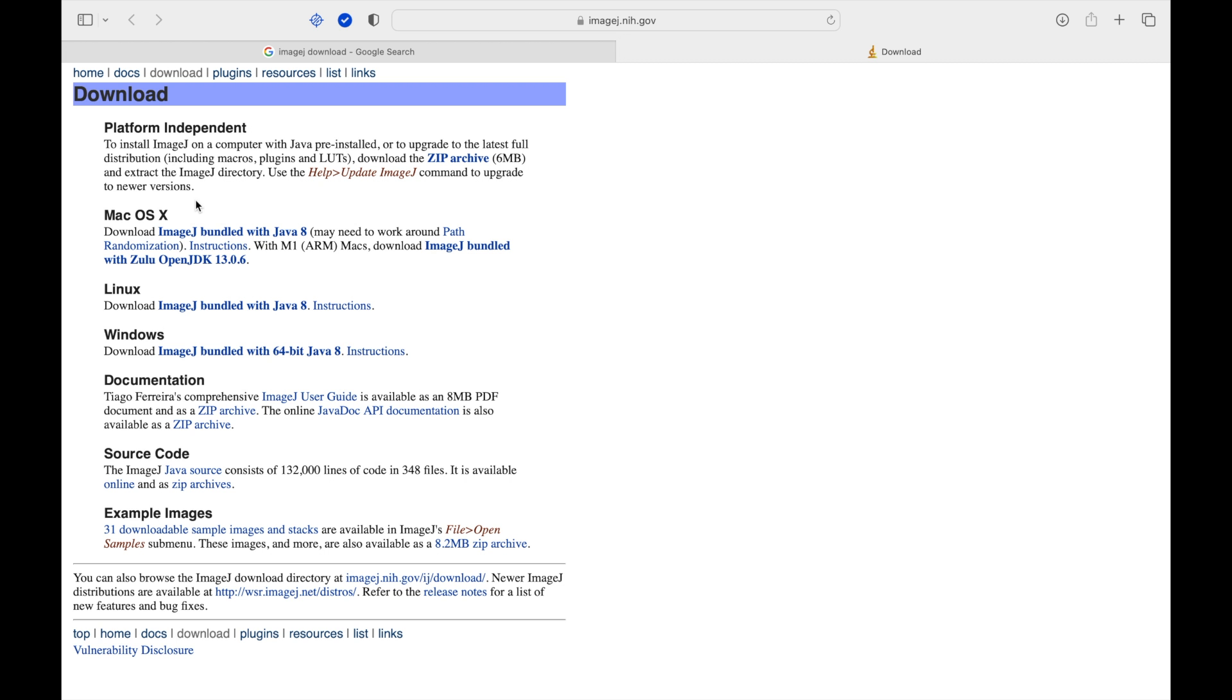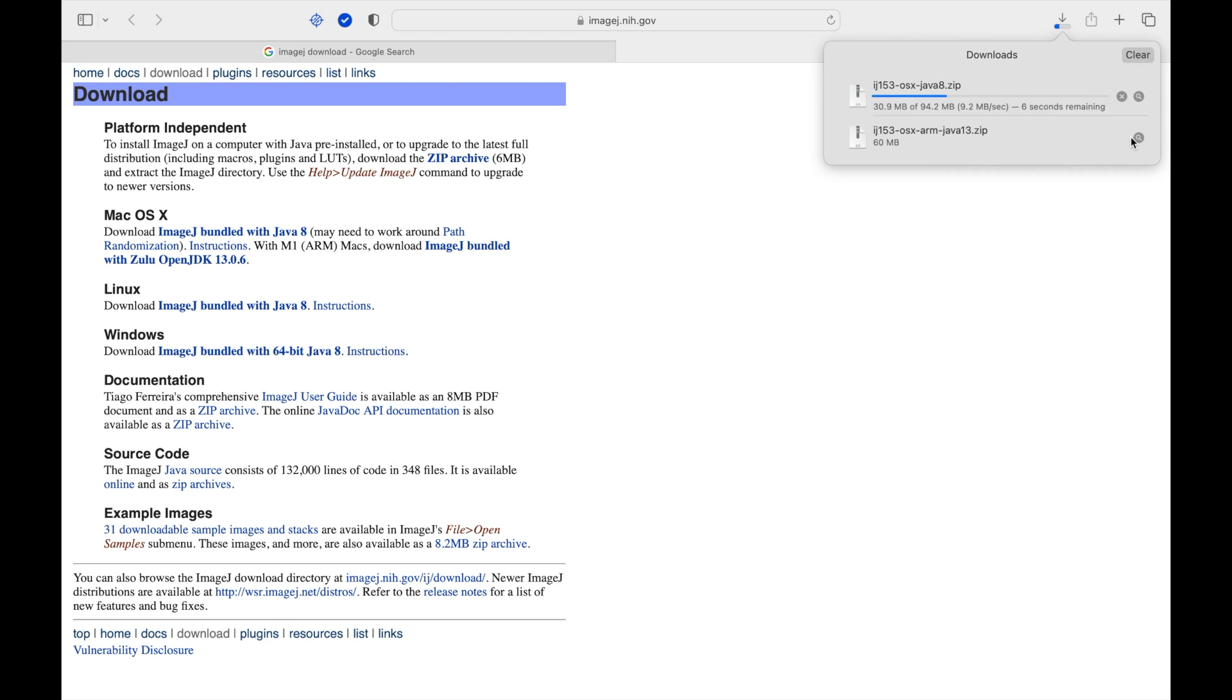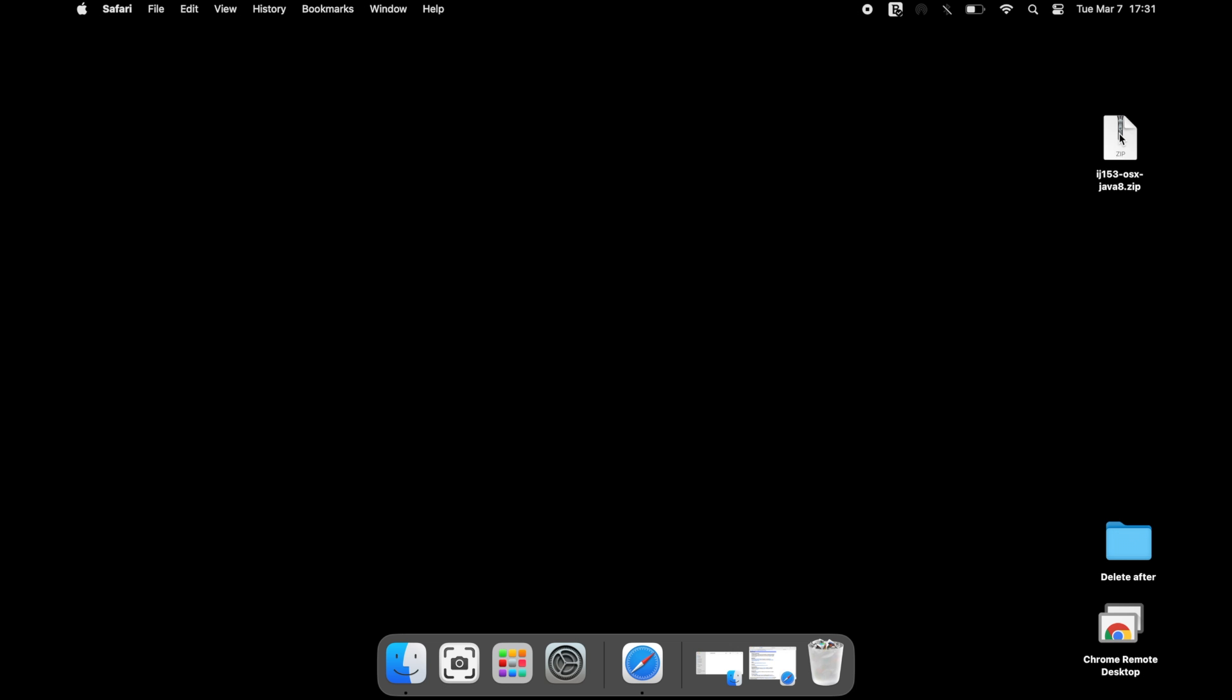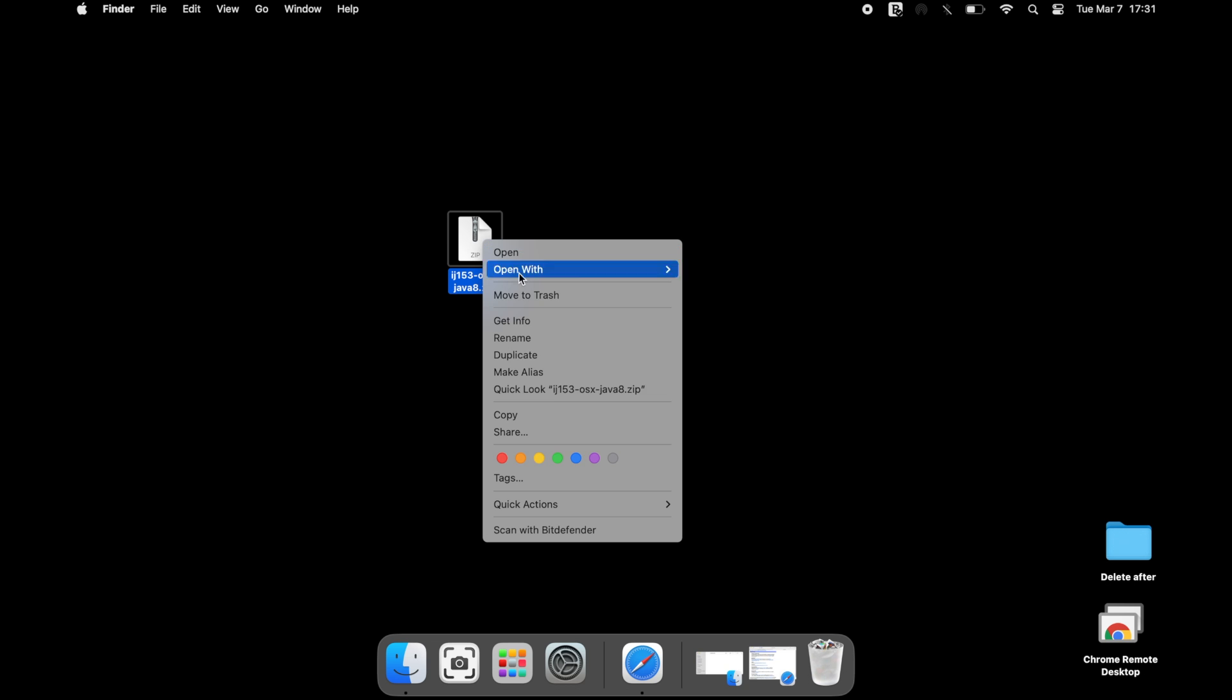To download and use ImageJ in Mac operating system, head to the website and select either ImageJ bundled with Java or ImageJ bundled with Zulu. Click to download the file. Copy the compressed file and paste it in a separate drive.